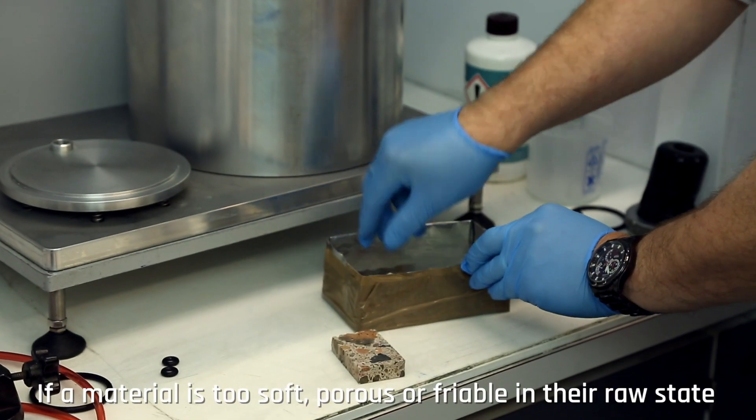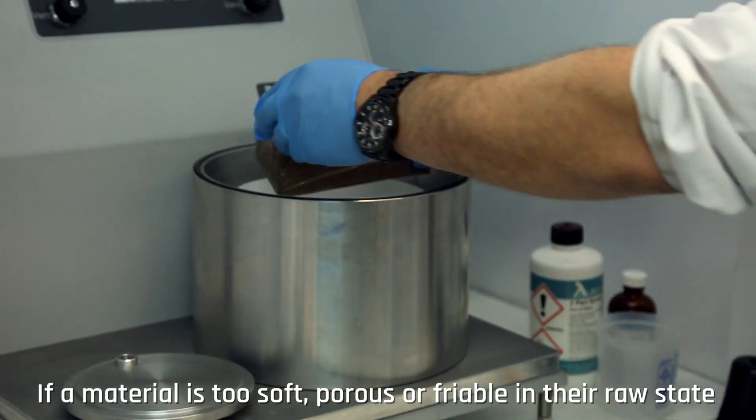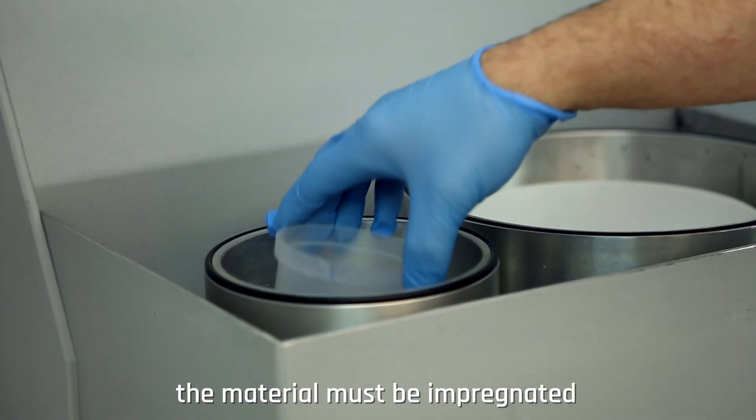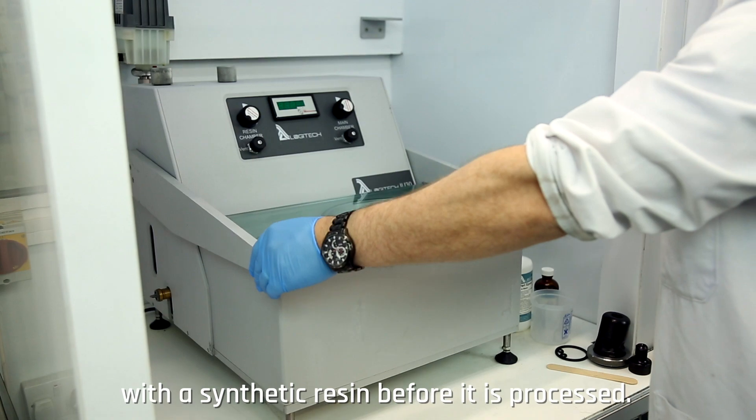If a material is too soft, porous or friable in their raw state, the material must be impregnated with a synthetic resin before it is processed.